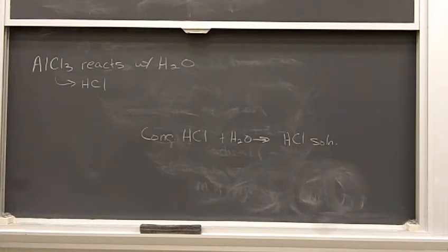If you have trouble separating the layers when you do the wash with water, just be careful. You want to mix the layers, but don't shake them really vigorously because you're probably going to have trouble with the separation again, okay? And so if you have to use sodium chloride solution in the first separation, you're probably going to need it in your second separation, all right?